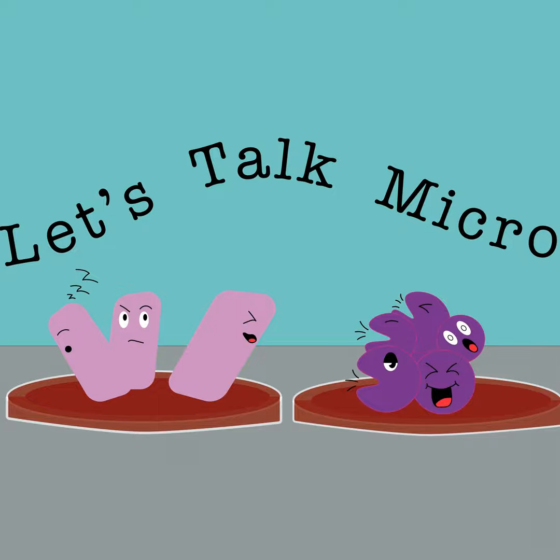So today we have covered 2 more tests, right? So right now we have 6. And with this, we actually conclude the gram-positive cocci. Of course, there are more tests. You students out there, when you're going through your class, reading your books, there's bile solubility and other tests. But these are the basic ones that if you know how to do these, you will basically have almost no trouble identifying gram-positive cocci.